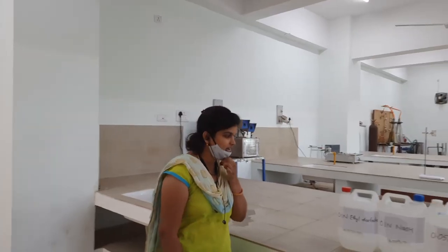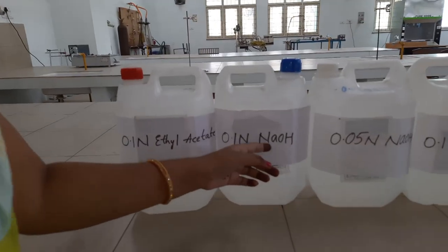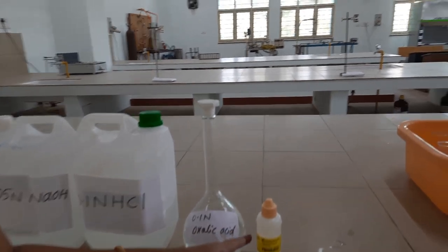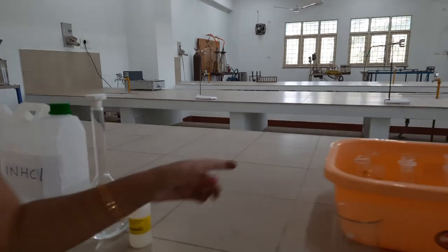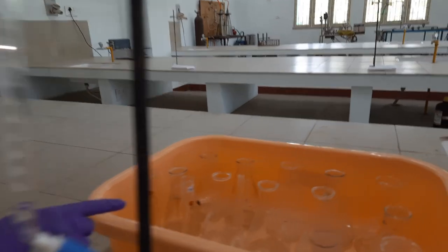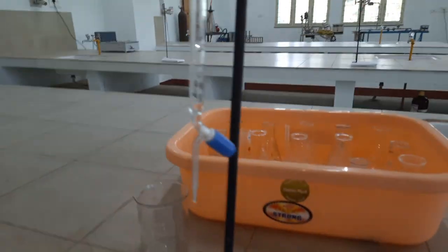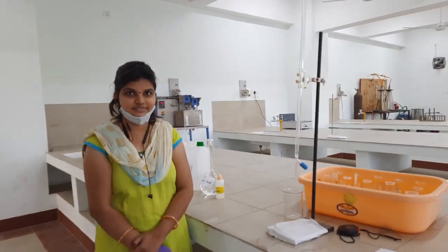The chemicals required for the batch reactor are 0.1 normal ethyl acetate, 0.1 normal NaOH, 0.05 normal NaOH, 0.1 normal HCl, 0.1 normal oxalic acid and phenolphthalein indicator. The glassware required: 12 conical flasks, measuring jar, funnel, beaker, stopwatch and burette stand. That's it.